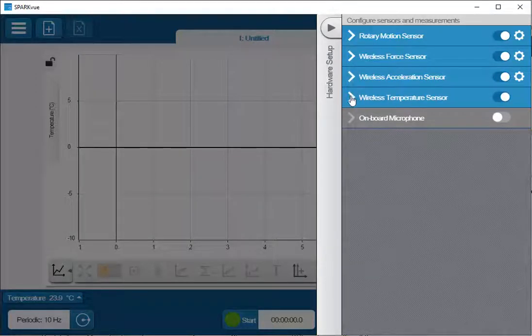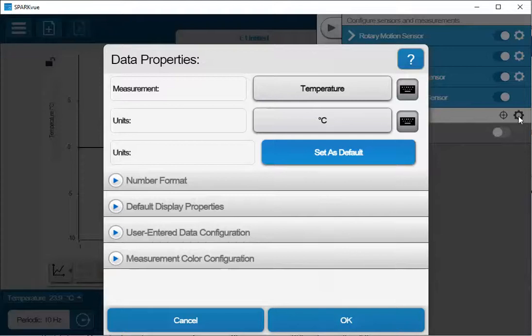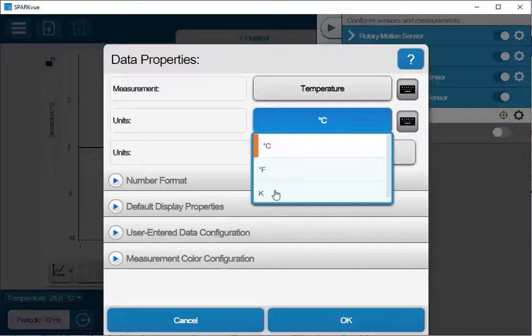And then finally, I have my wireless temperature sensor. This again has the possibility of calibration, and it has its own data properties, including being able to set the default units. So depending on whether you want to see Celsius, Fahrenheit, or Kelvin as a default display on each of your new displays you create within SPARKvue.